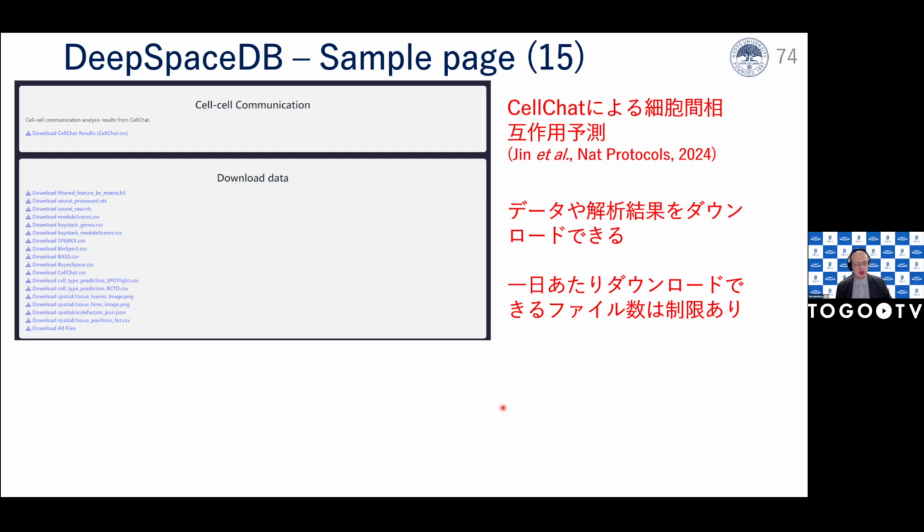However, if you're trying to use Xenium data, I think you will need at least 64 gigabytes of RAM. I think 128 gigabytes of RAM should be enough, but maybe for really huge samples, I have not tried to analyze on my PC. So I'm running it on the server, which has 256 gigabytes. I hope that answers that question.